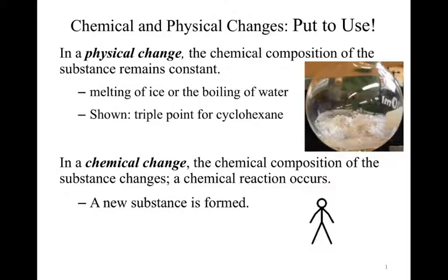In today's lab, we will actually take advantage of chemical and physical changes and put them to use. In a physical change, the chemical composition of the substance remains constant, like the melting of ice or boiling of water. And in a chemical change, the chemical composition of the substance changes; a chemical reaction occurs.